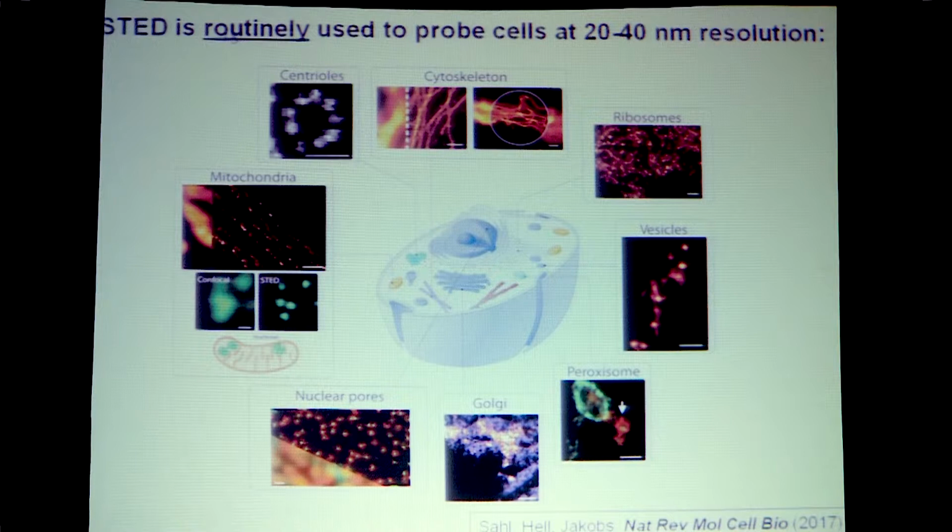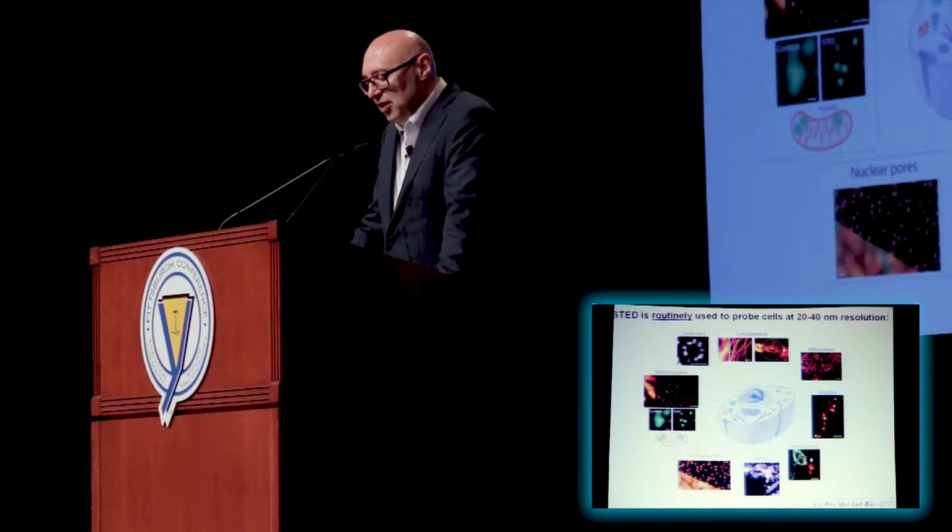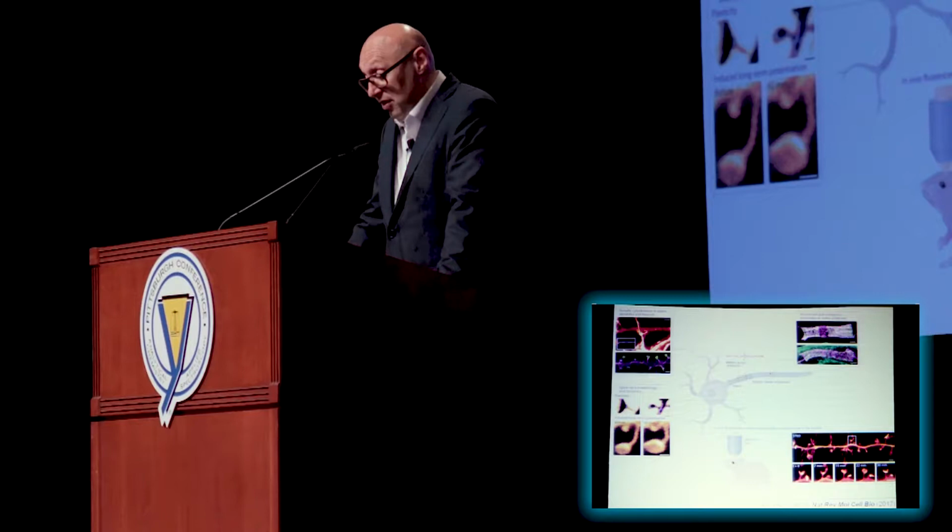And as you can see, of course, the areas, it was applied to the cytoskeleton, mitochondria, Golgi apparatus, and so on, both in fixed cells and in living cells. There are some compromises that you have to take at present when you apply it to living cells, but it also works for imaging living cells. And another view graph here shows the application range in the neurosciences in particular, where it has also been applied to the imaging of neurons in vivo, to the molecular layer, to the upper layer of living mice.